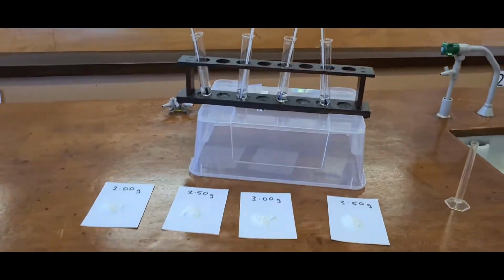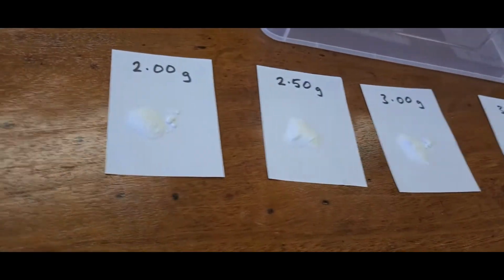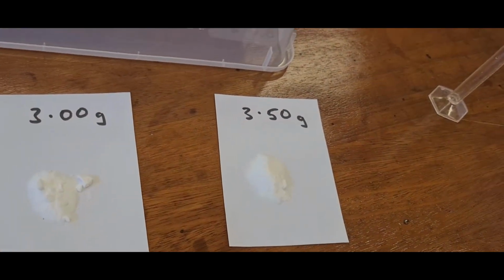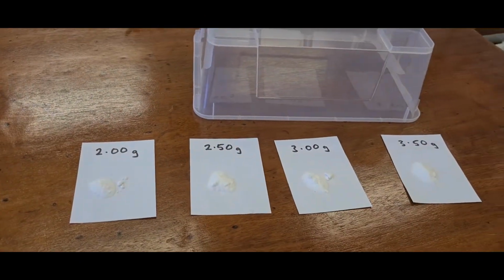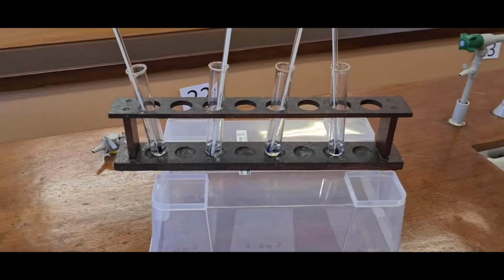I've set up 4 test tubes of ammonium chloride: 2 grams, 2.5 grams, 3 grams, 3.5 grams. I've measured it accurately using a 2 decimal place balance. You can see the accuracy based on the masses I've written down.